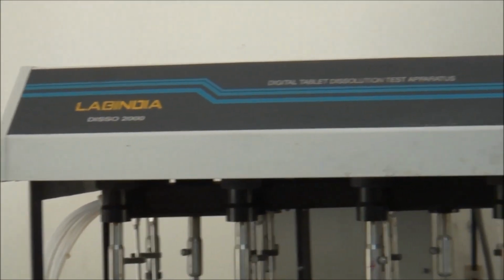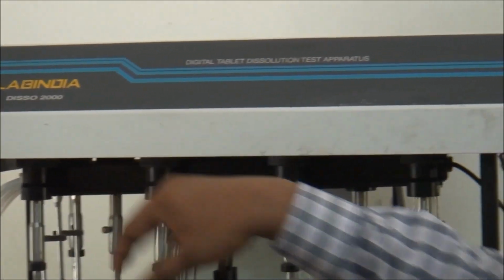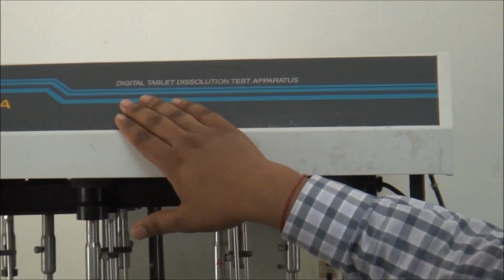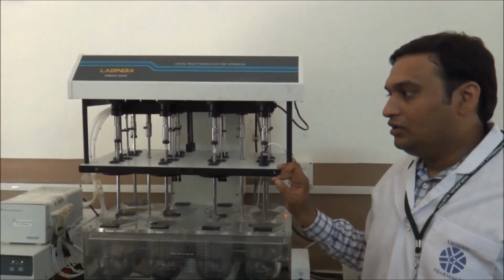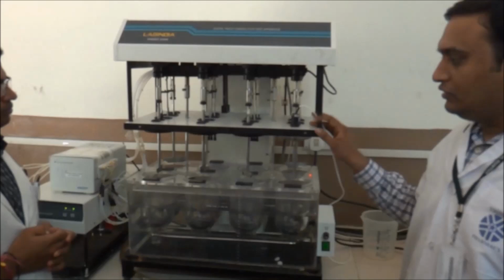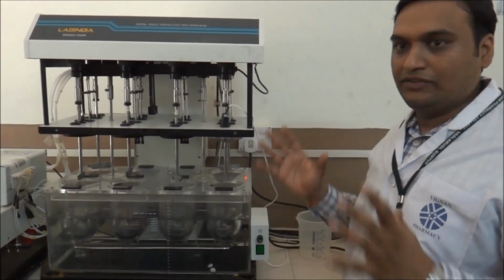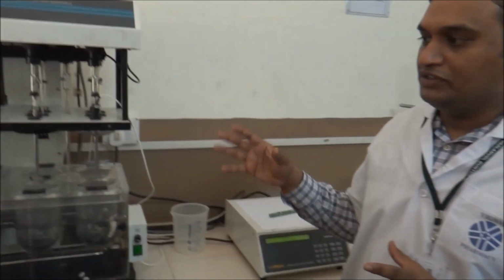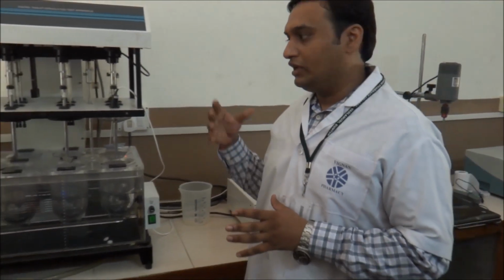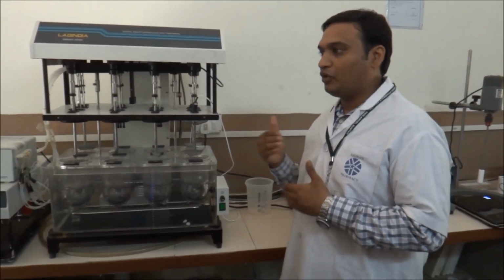In Lab India we have various models. This is the Lab India Disso 2000 model, and as you can see, it is the digital tablet dissolution test apparatus. Now let us see what the visible components in the dissolution apparatus are. Once we come to know each and every visible component, then we can clearly understand the function of each component, and then we can understand the process.